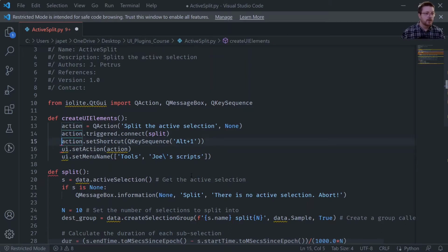As you may recall, Python is very particular about the way that things are indented, and it's not immediately obvious here, but the original lines of code that are here are indented with spaces, and the new line that I've added is indented with a tab, and it's not going to like that. So I'm just going to re-indent those so that they're all done with tabs.